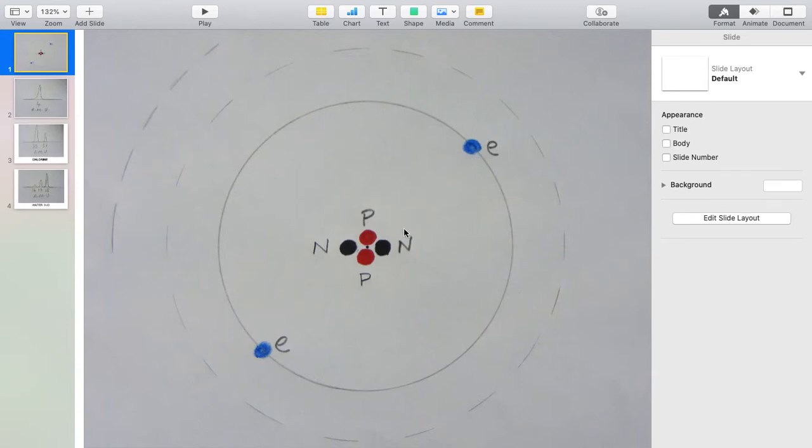So really the simple view of this is just that protons and neutrons are the particles that give an atom its mass, and a proton weighs the same as a neutron, and electrons have negligible mass. So really, like this, the mass of an atom just depends on the number of these things in the middle. It's an integer that depends on the number of these.